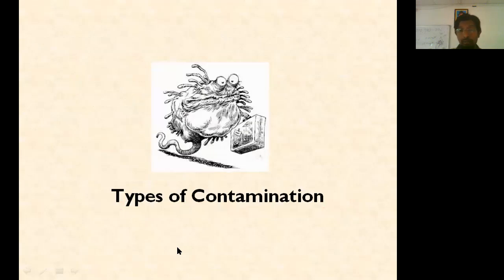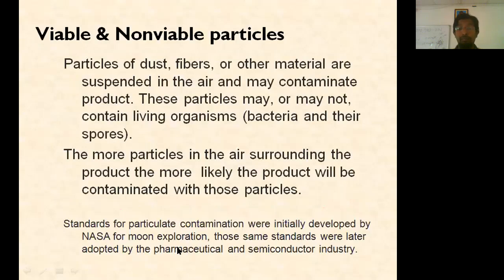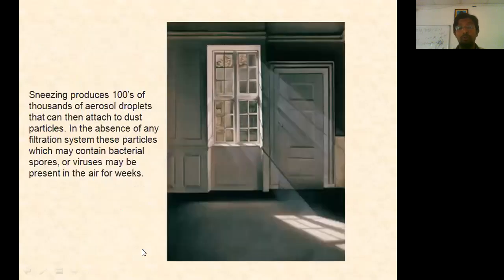Right? There are a lot of types of contaminations, viable and non-viable particles. This is not a microbiology class, so you don't need it. Like I said, the rooms shouldn't be open, with broken windows allowing air, light, and everything inside the room. Such kind of room is not at all allowed, right?